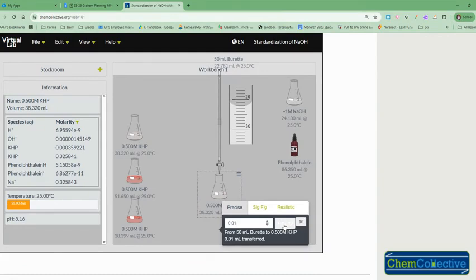Here is an extra one, and that one's clearly a faint pink, so that would be 29.23. If I do 29.24, it's too dark. So I am happy with my 29.22 for my final for trial 3. All right, you should do your subtraction to get your total volume and then complete the rest of your lab.